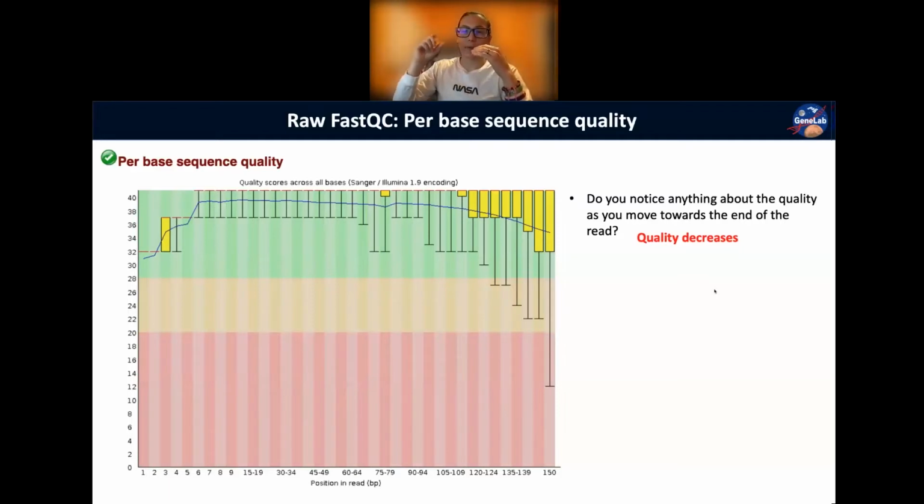So we also have that blockage at the end of a base pair to make sure that only one base pair is incorporated at a time until a picture is taken, and then that termination is removed, so that way the next base pair can join on. And so over time, as these reagents are in the machine, that blockage could come off, and then you can have two nucleotides incorporated at a time, which will confuse the signal.